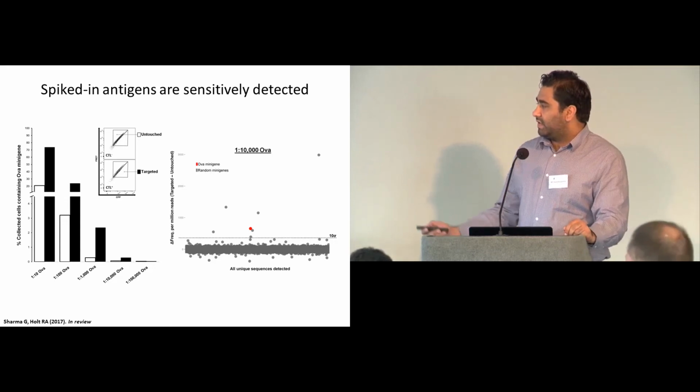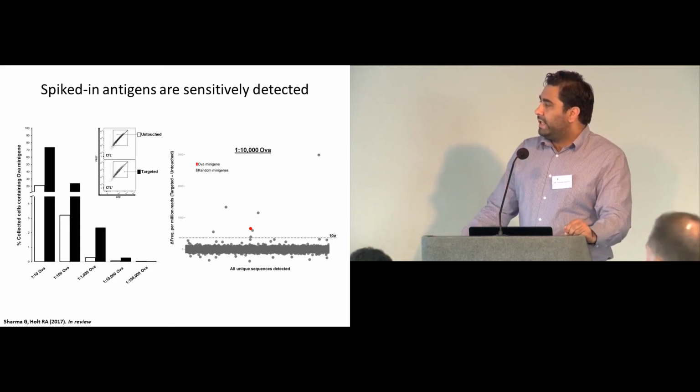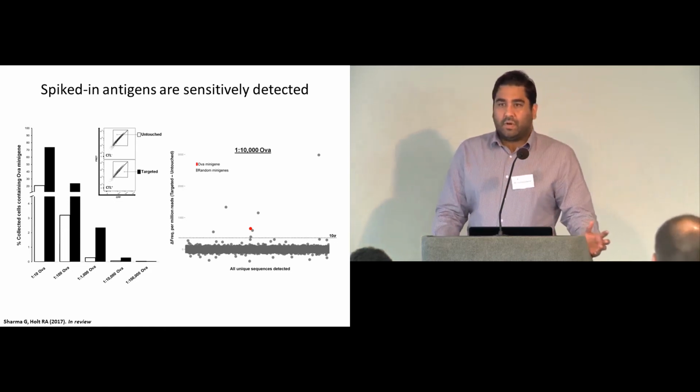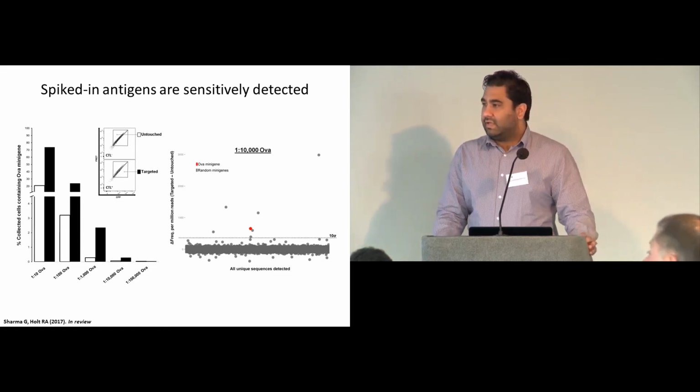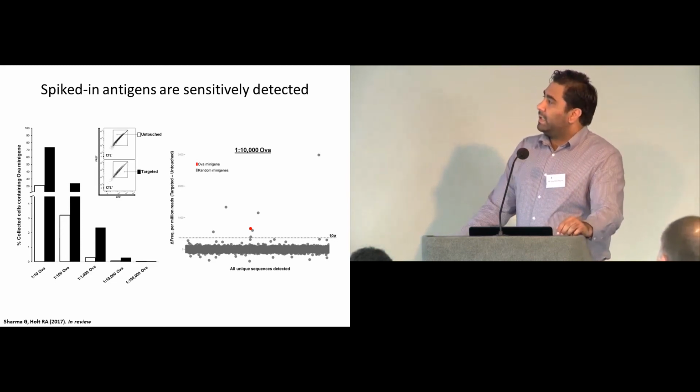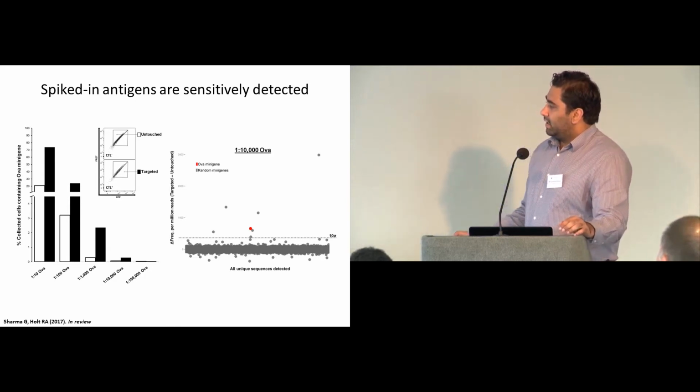And so these data indicate to us that this approach is able to match the sensitivity of the existing gold standard methods like ELISpot and so on, but with the added advantage of being able to simultaneously query over 1 million different unique peptide coding sequences.